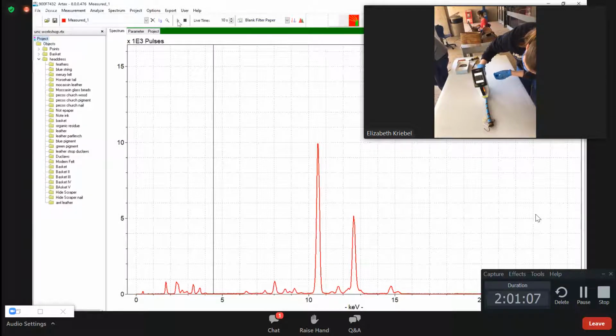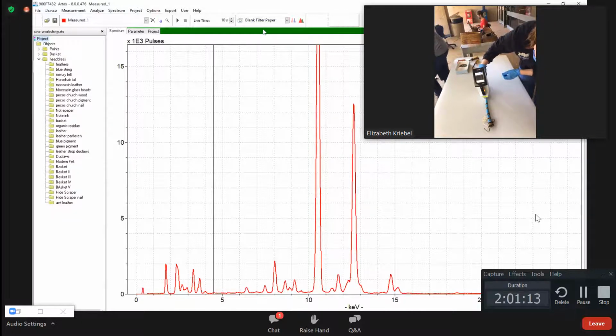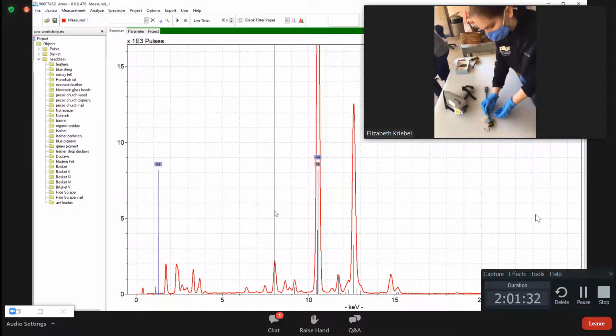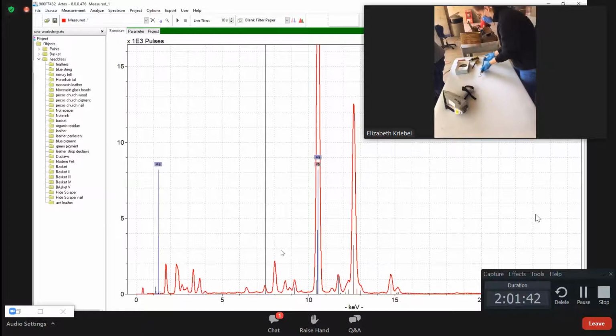Yep. Lead. Inherent in the beads. Oh yeah. The beads are almost all lead glass, without any exceptions. What will change is what other elements are present. So here are the big lead lines here. There's also arsenic in them too. So they've got that going for them. That's that copper color you see. Okay, so they added copper in, like a Prussian blue or something. That's not right. I'm so bad at pigments these days. I am so out of practice on my pigments. Is the arsenic also just part of the glass? Yeah.